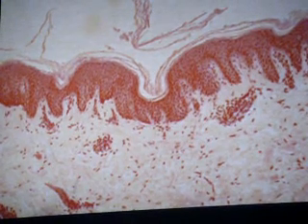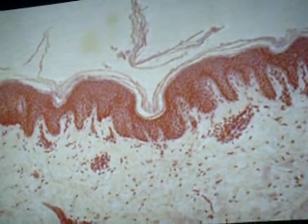Okay? Identify whole organ. Be specific. Skin. Is it thick or thin? Actually, I really do not know. Kasi remember, you base the classification of the skin on the thickness of the epidermis.